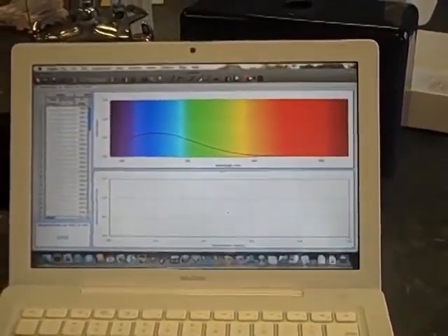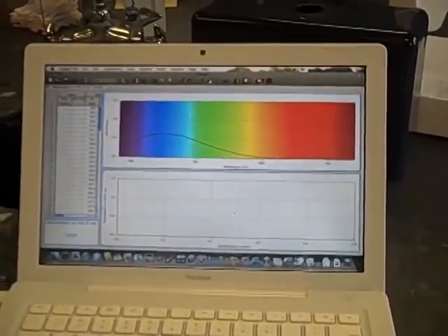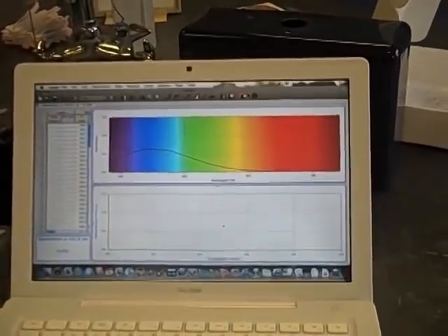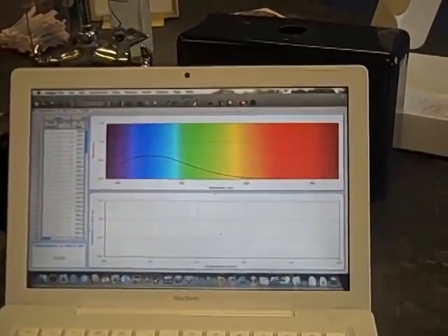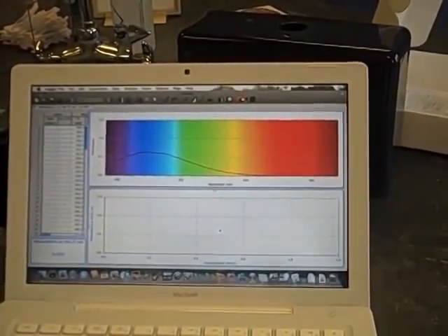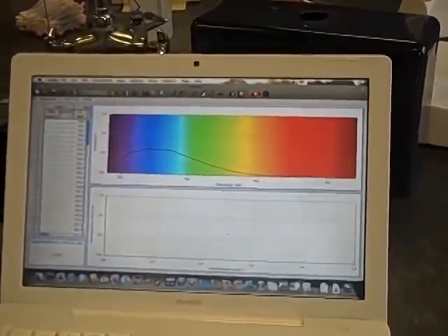Now, you told me something important about between the two cuvettes. What should the students remember? Is it okay to put another one in real quick? No, you need to wait 2 to 4 minutes, but not longer than that, to let it stabilize, so that number will become more constant, because right now it's kind of changing.